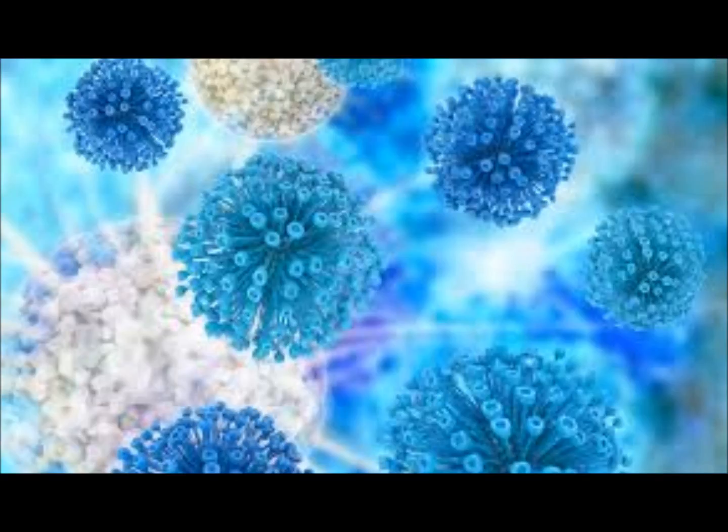And what are, we won't do clinical gram stains. Today we're going to look at pure gram stains. But the only gram stain that's really easy, and that's the one we start with, are blood cultures. Because on blood cultures, you just tell what organism is present. You don't even enumerate. So that's the easiest clinical gram stain to do.